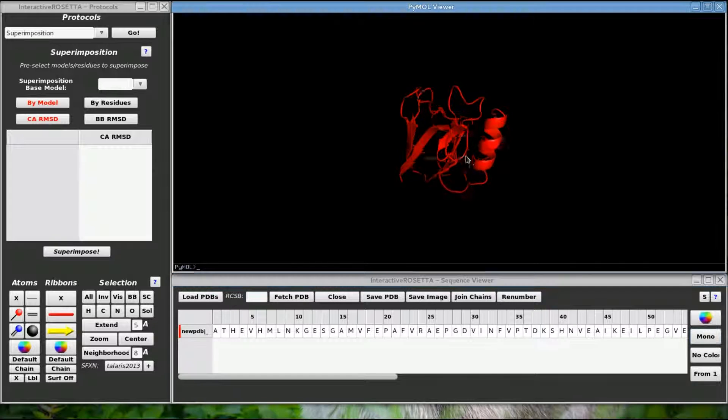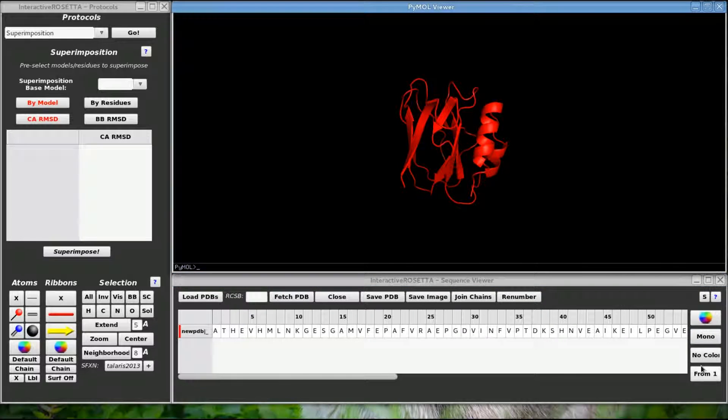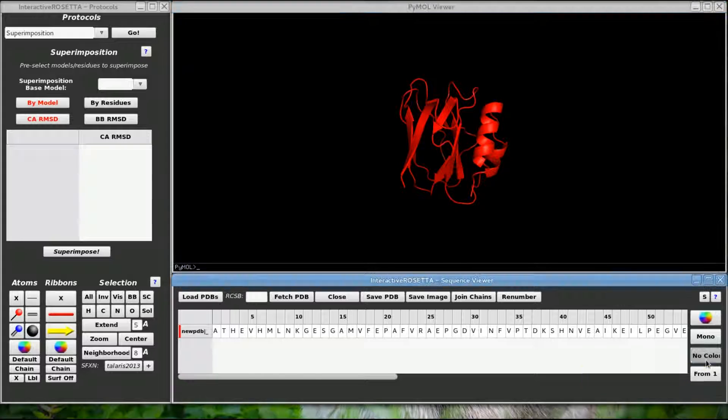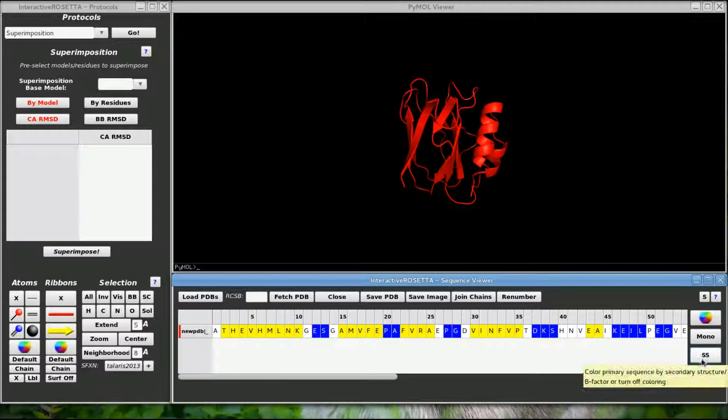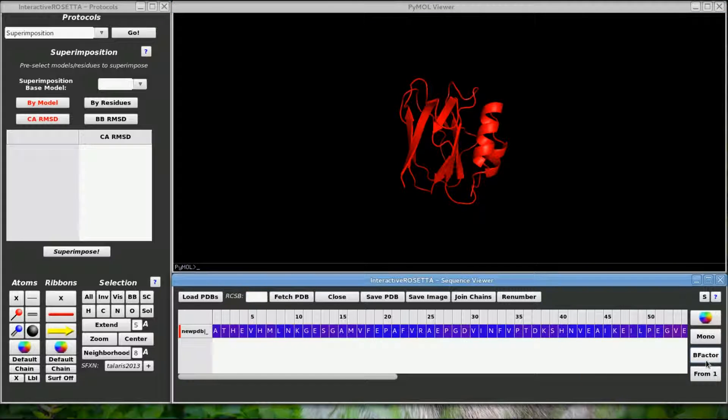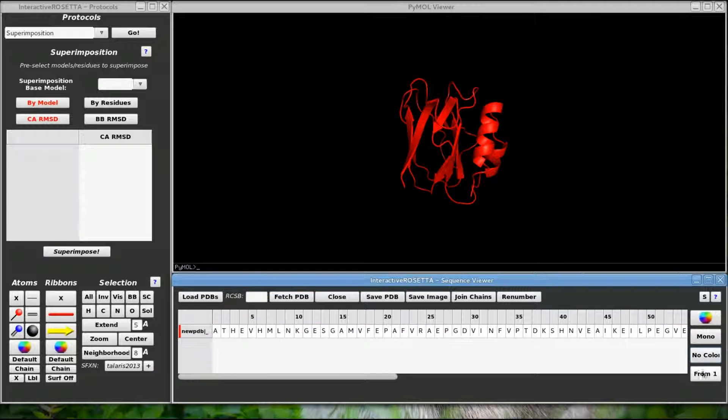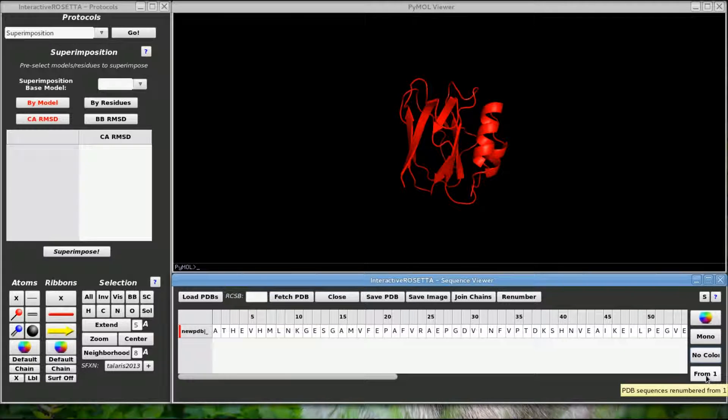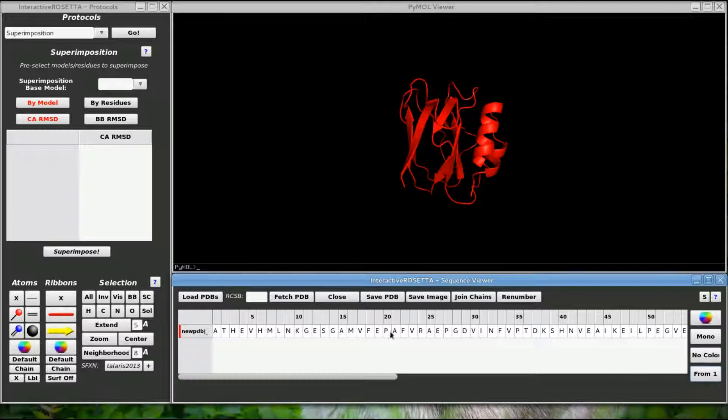This button changes the coloring of the primary sequence. This colors by secondary structure and this colors by b factor. This last button will change the column labels to display the actual PDB numbering instead of the absolute index of the residues in their sequences.